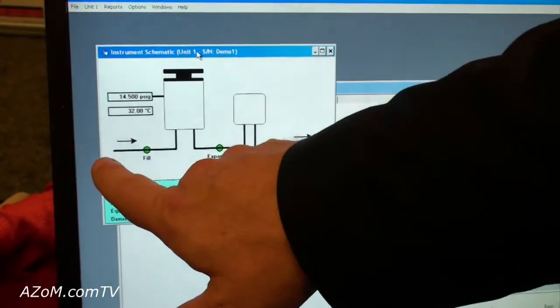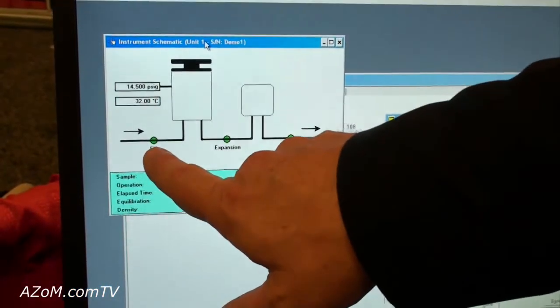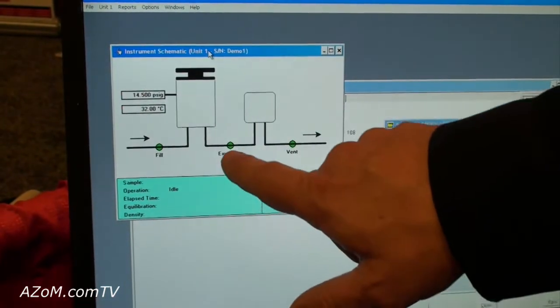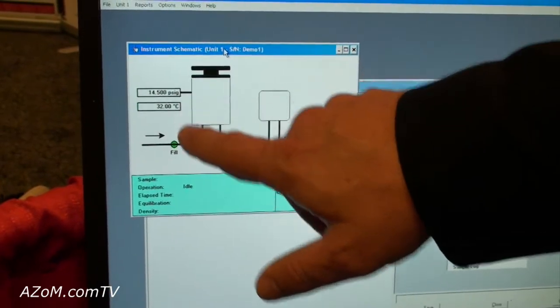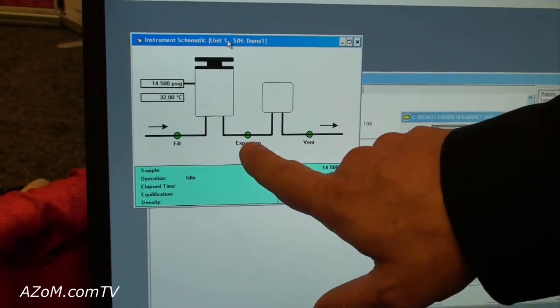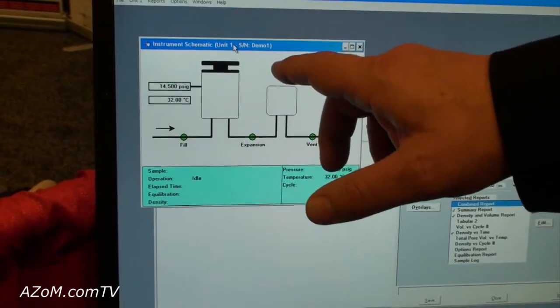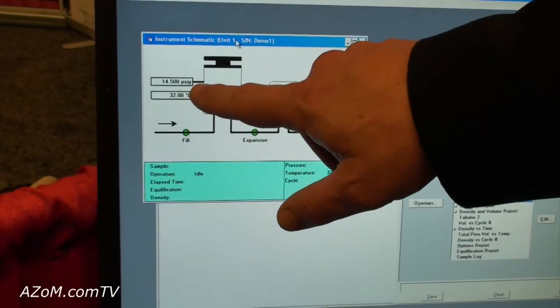Essentially, we connect pressurized gas, admit it through a fill valve and pressurize the sample to a user-specified pressure, record that pressure with a transducer, open a valve and permit the gas to expand into this expansion chamber. The pressure drops and we record that second pressure.